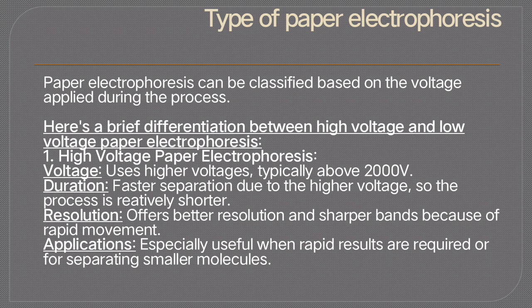Resolution: offers better resolution and sharper bands because of rapid movement. Application: especially useful when rapid results are required for the separation of smaller molecules.